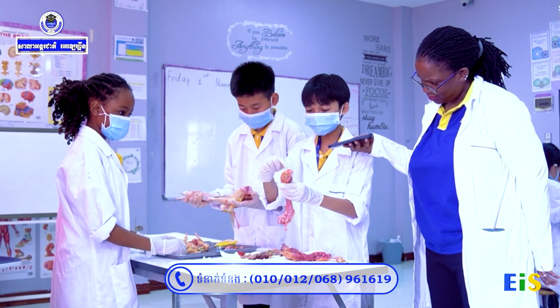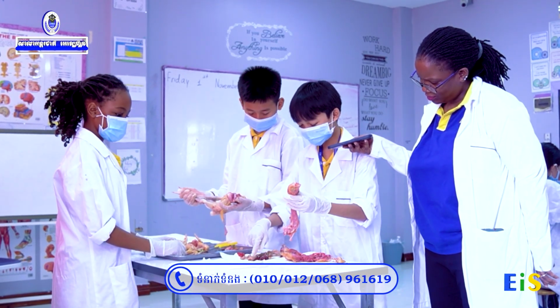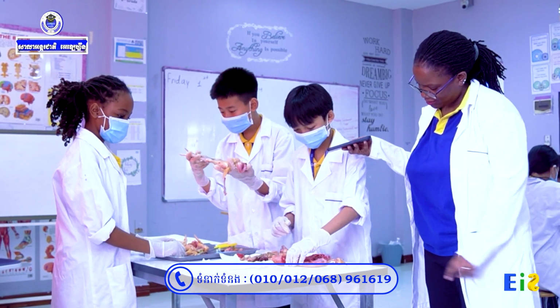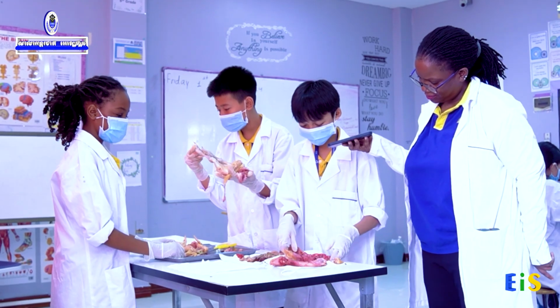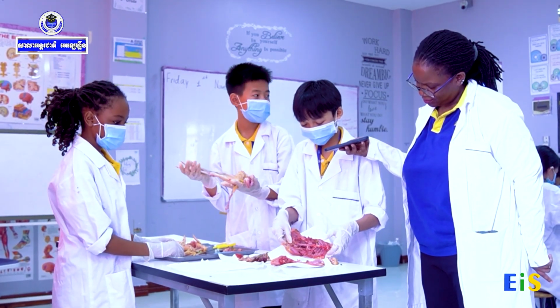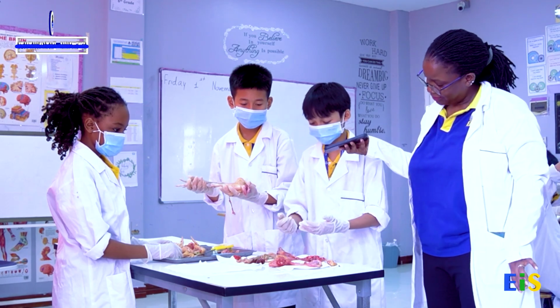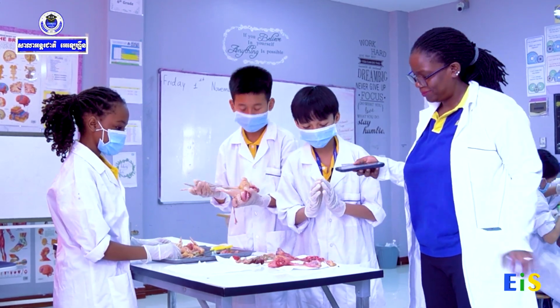So the chicken eats its food, and it goes down the esophagus. And this is the rib cage and the spinal cord.